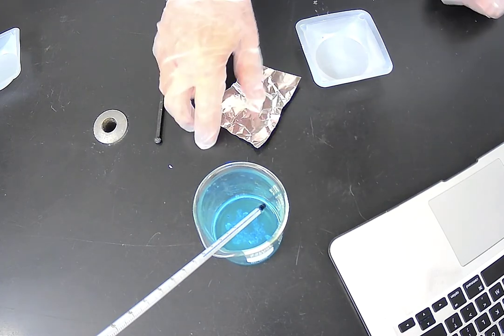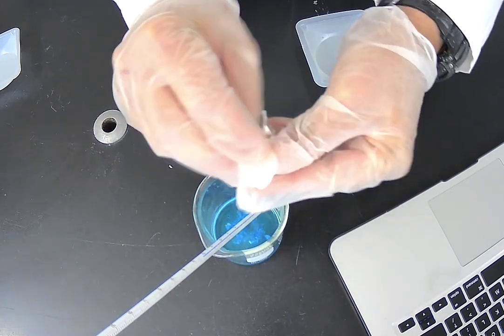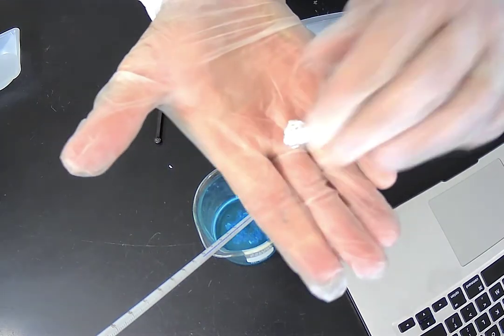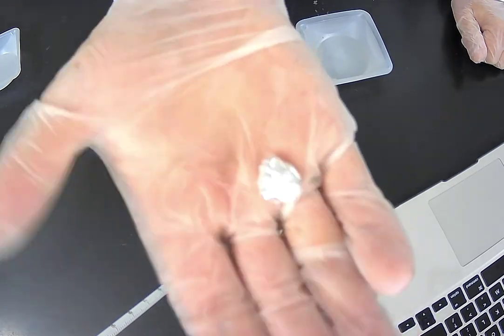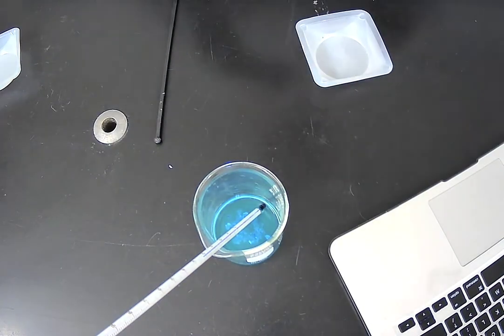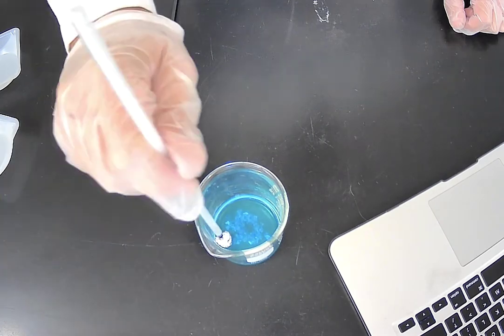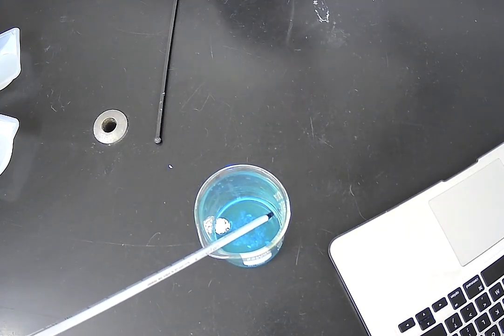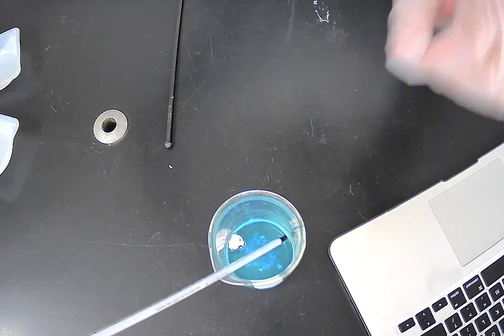All right, so now comes the part where we're going to take this aluminum foil and wrap it into a ball. So once again, this is a physical property, right? It's very malleable. I can't do this with other metals; lead and copper will not do that for me. Okay, not as easy anyway. All right, so I'm going to drop my aluminum foil in my solution, and I'm going to record what the temperature is every minute. And I'm noting any observations here.